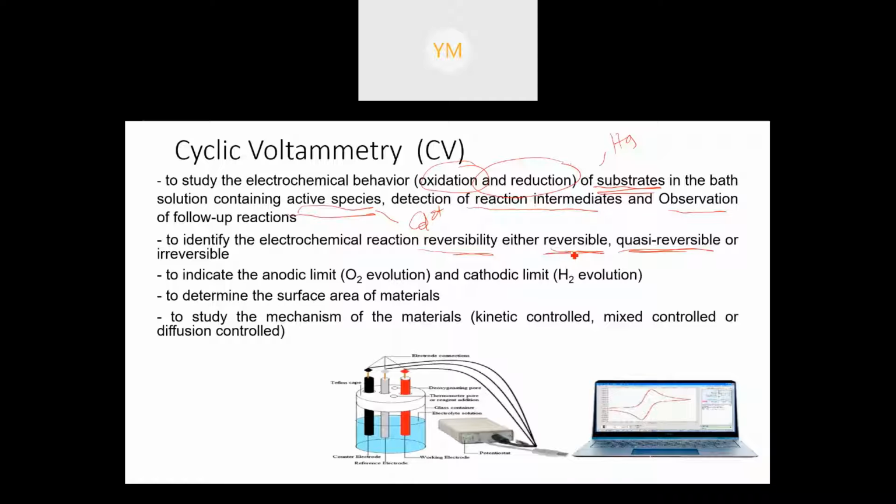I'm going to talk about this later on. Irreversible means not reversible. I will show you the type of cyclic voltammogram which represents reversible, quasi-reversible, as well as irreversible.